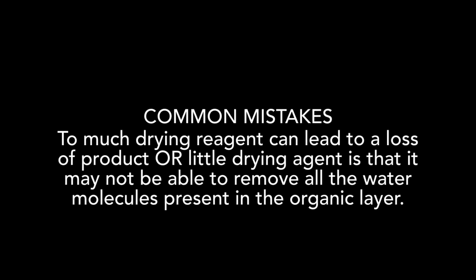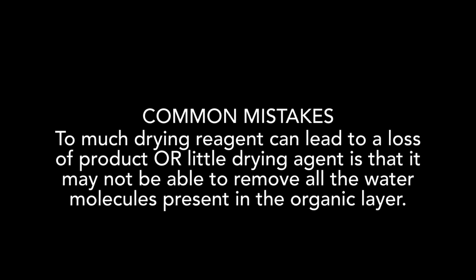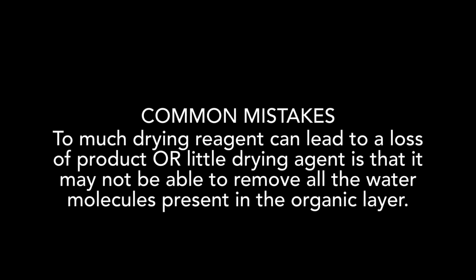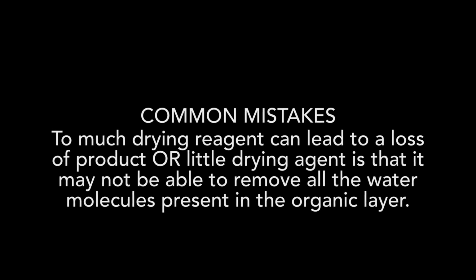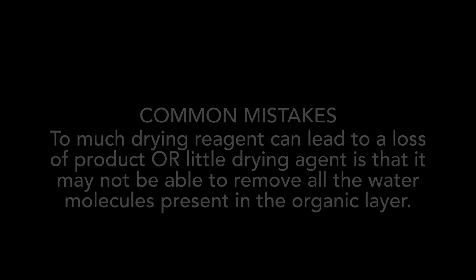Keep in mind when performing this experiment, some common mistakes are adding too much drying reagent, which can lead to a loss of product, or not adding enough drying reagent, which doesn't allow for all the traces of water to be absorbed by the magnesium sulfate. Now, to avoid these mistakes, make sure to only add a spatula full at a time and to swirl in between, looking for that snow globe consistency.